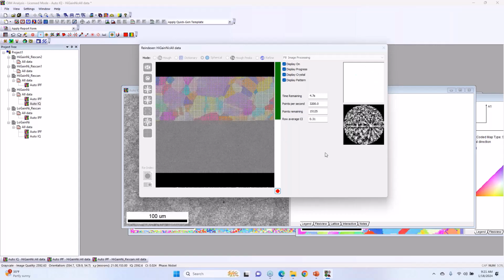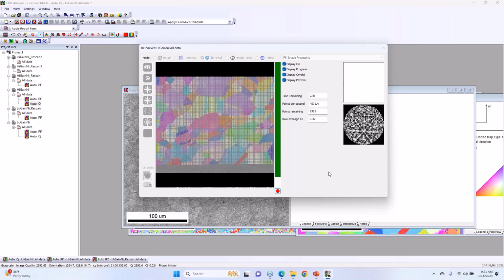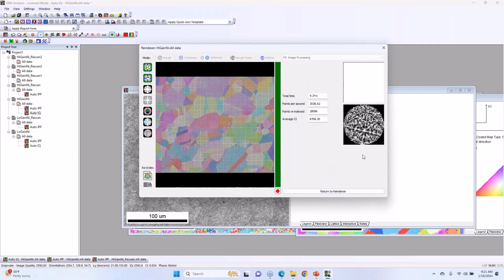So this is a function of a lot of things, but the biggest thing, I think, is one, the pattern size, and two, where they're stored. Generally, the most common resolution that I use is 120 by 120 pixels. I think we see the best performance overall across the range with that. These are a little smaller for our demo data set.